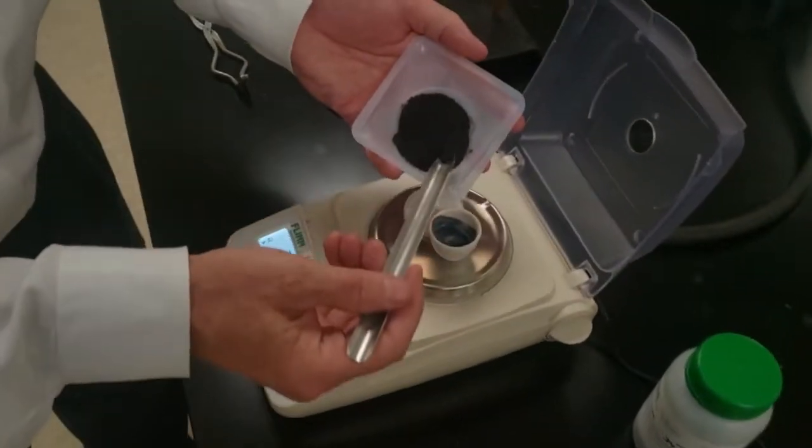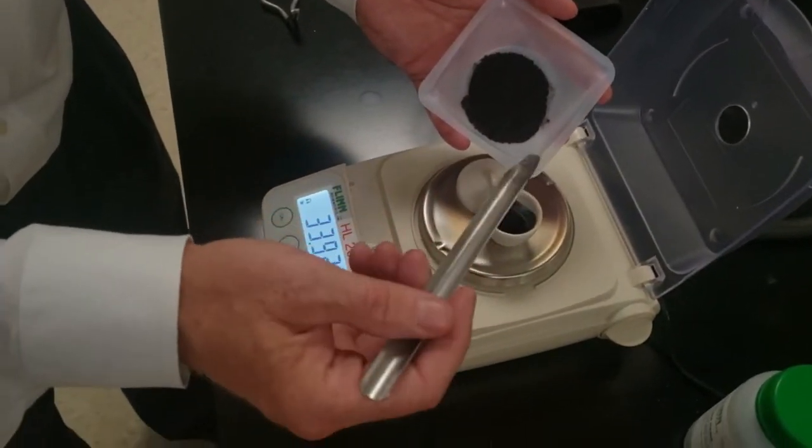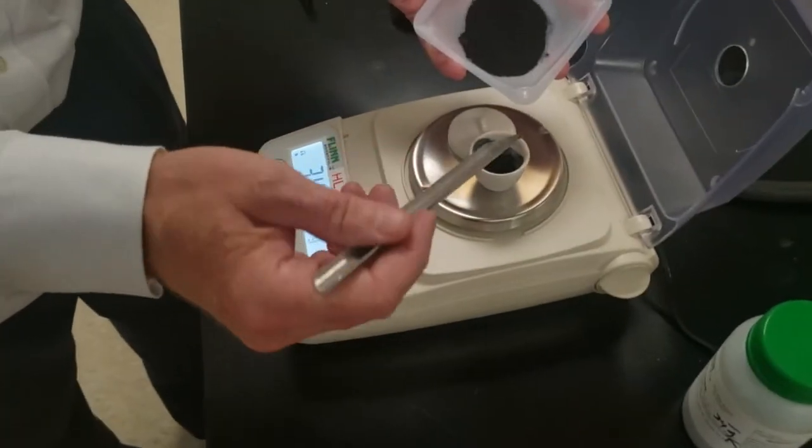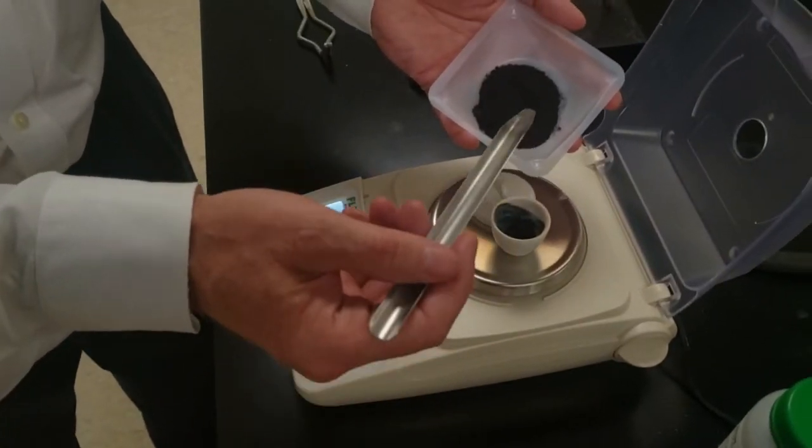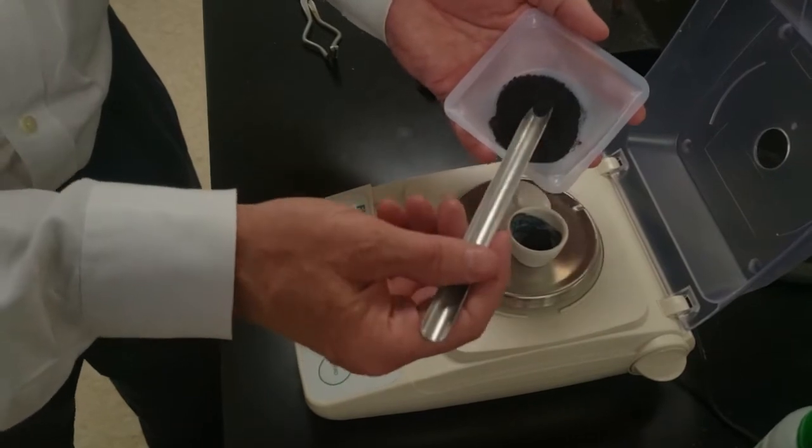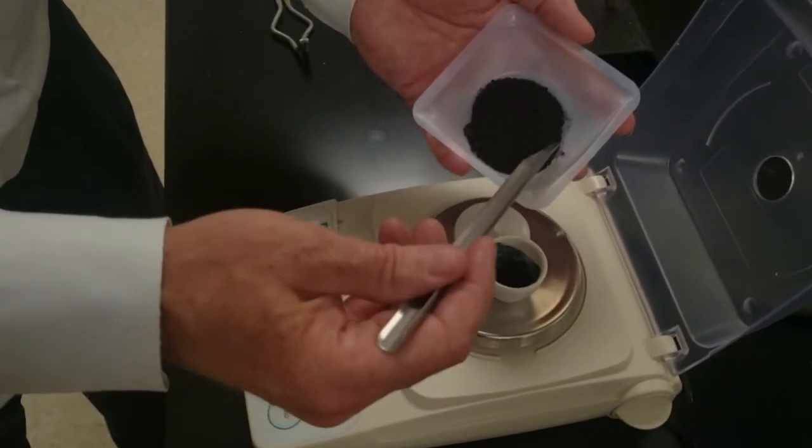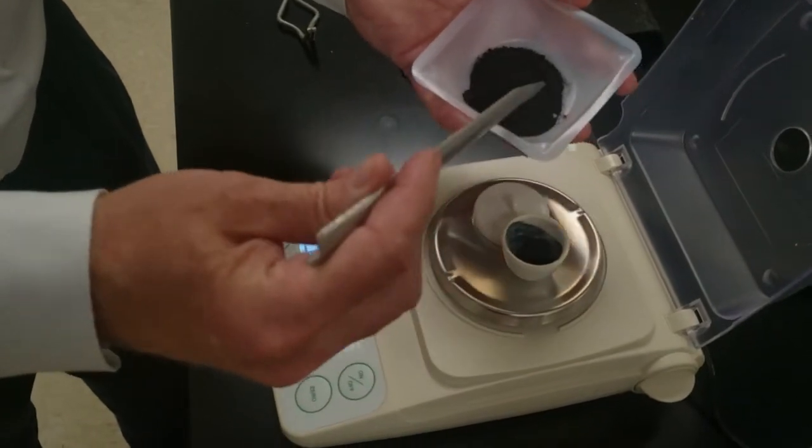Now, normally we don't like putting chemicals into containers right on the scale, but in this case we have to. We want anywhere from a half a gram to a gram. We're going to do right at a gram. So just add one to the number that was already on the scale and try to get that number, or maybe just a tiny bit above it.